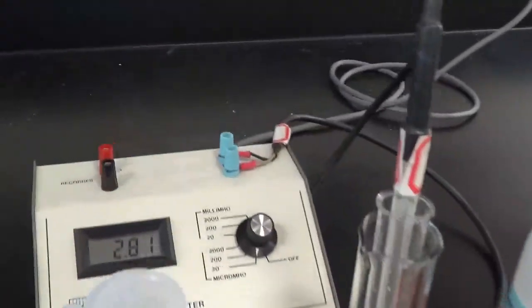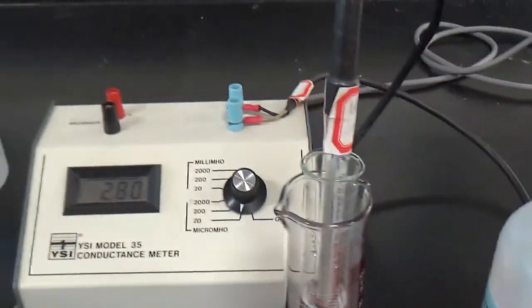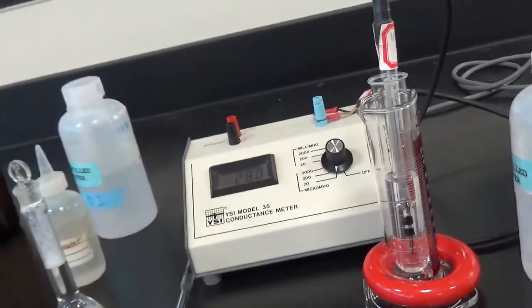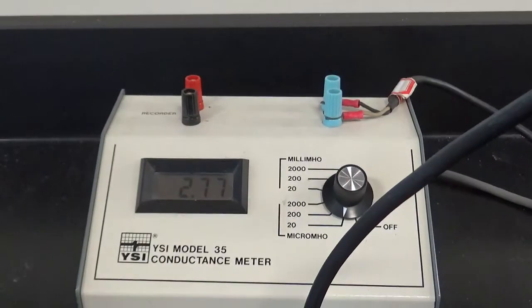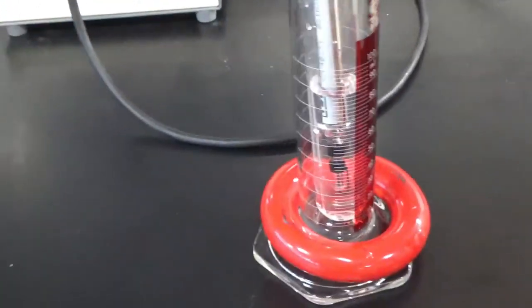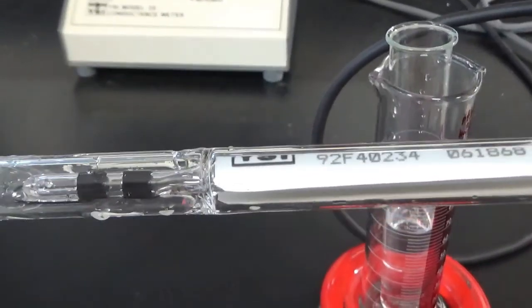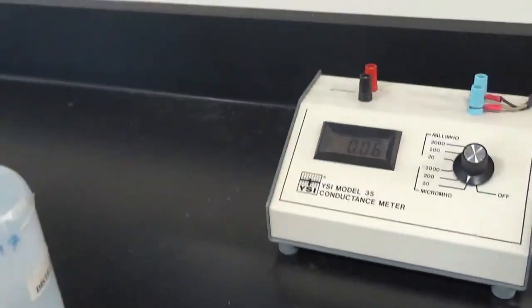So I want to show you this conductivity meter that I'm going to be using. And the first thing you need to do is rinse it several times with deionized water. Okay. So here's the conductivity meter. You could see what it reads right now. It's been sitting here for a while. So here I have what we call the conductivity cell. It looks a little like it's broken on the bottom, but the place that's important is between the 2 black rings over there. That's the part of the cell that's actually the working part.